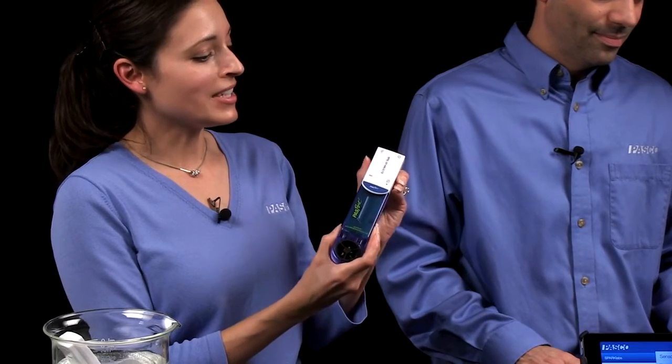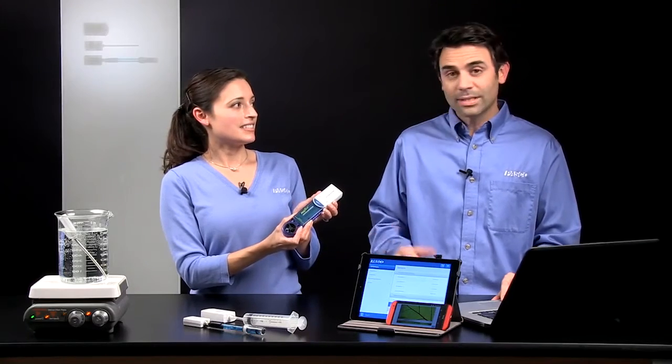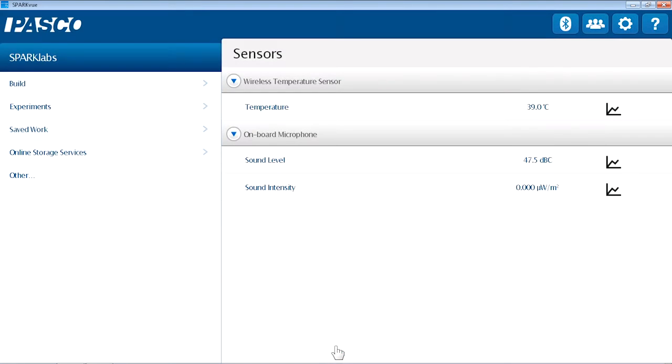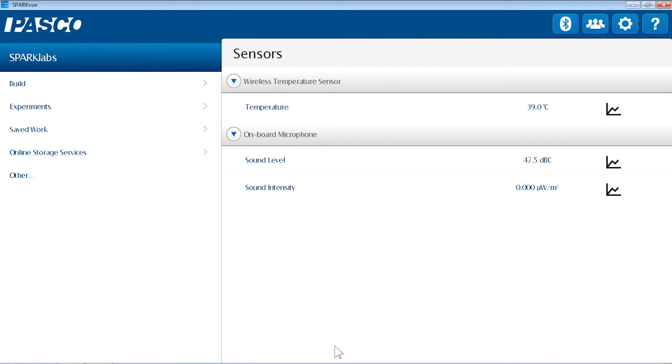We turn on the Air Link. And once that's on, just like I did before, I'll connect via that Bluetooth icon. And now I see the Air Link in my device list. If I touch on Air Link, it will connect to the Air Link. And on my home screen, I'll see all the measurements that are available with this multi-measure sensor.